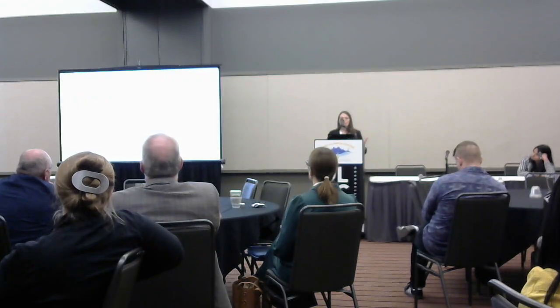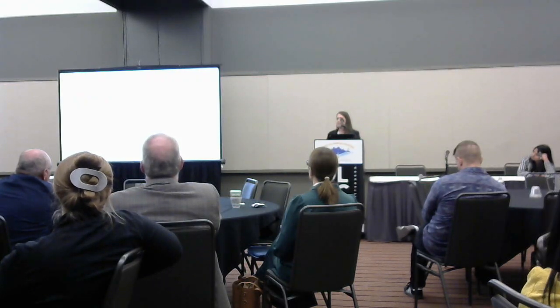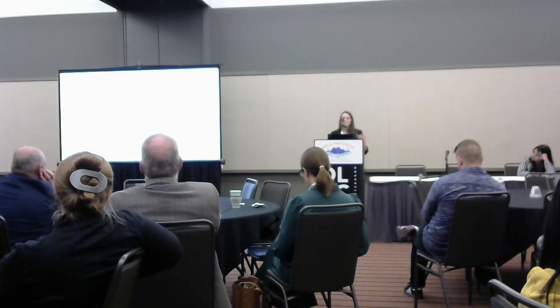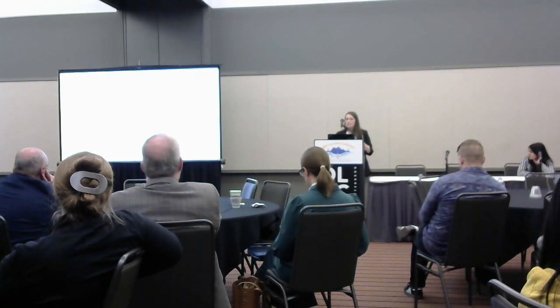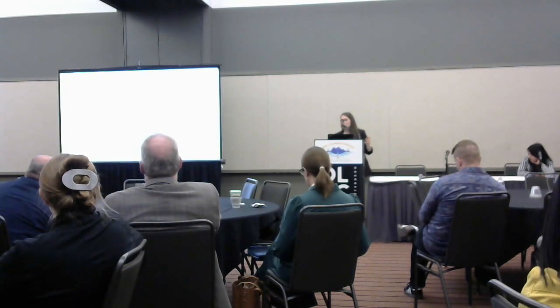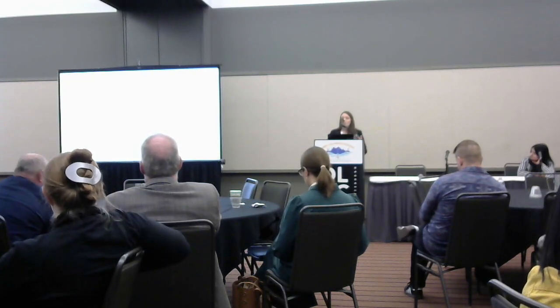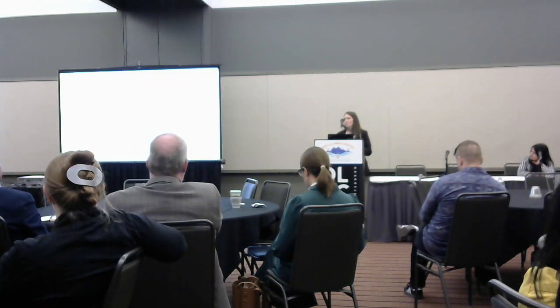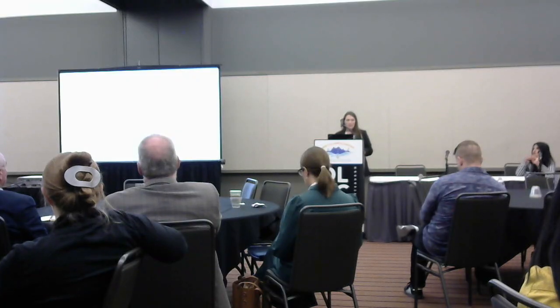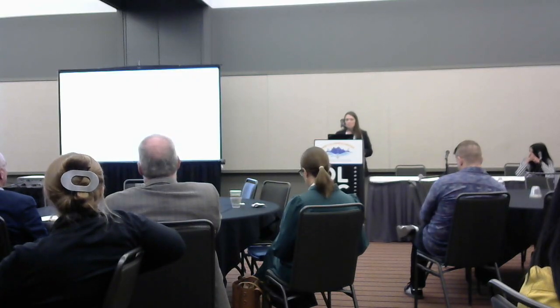To summarize all of this together, image analysis is not a one-size-fits-all process. To teach researchers this concept, they need to understand basic principles of image analysis methods. They require iteration. There's many choices that influence the images as well as the analysis process. Images are really complex numerical data, and you have to understand what the method is actually doing to understand how you can utilize that in your quantitative analysis.